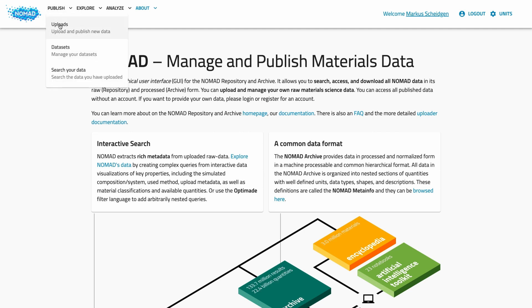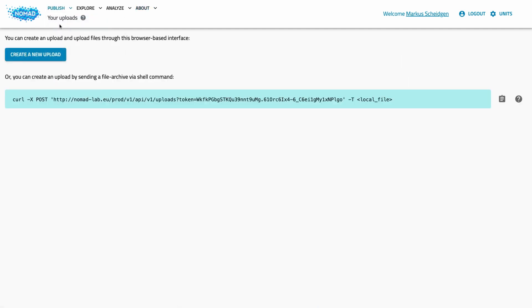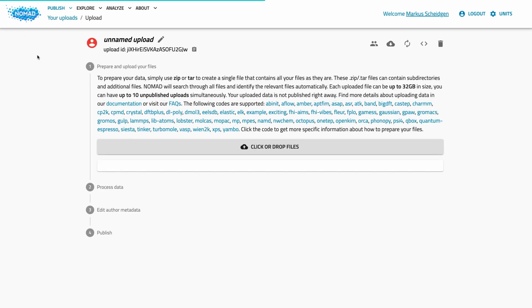Let's have a look at the upload page. Here you can manage all your uploads. An upload is a collection of data that you want to manage and eventually publish together. You can imagine an upload like a project folder on your computer. It can take many files and an arbitrary subdirectory structure. Uploads are a means to organize your data, collaborate with colleagues, and publish related data as a whole. On our NOMAD installation, an upload can be up to 32 gigabytes in size and you can have 10 unpublished work-in-progress uploads at the same time. To create an upload, press the create button and this will bring you directly to the page of the new upload.